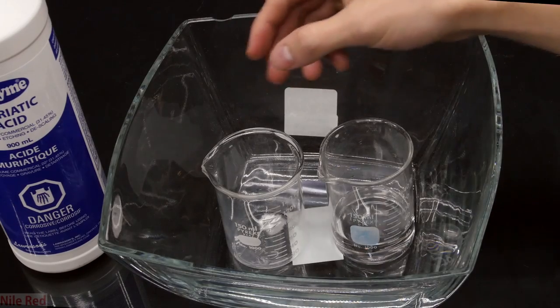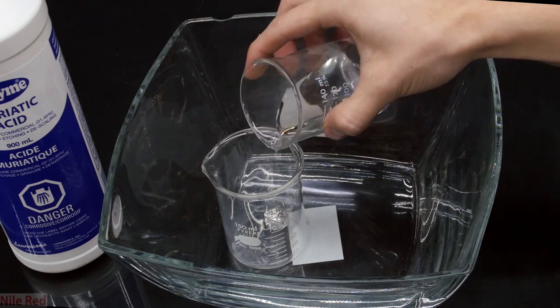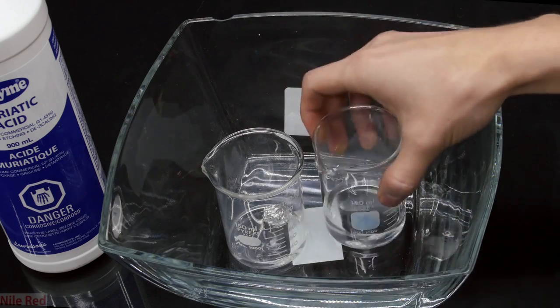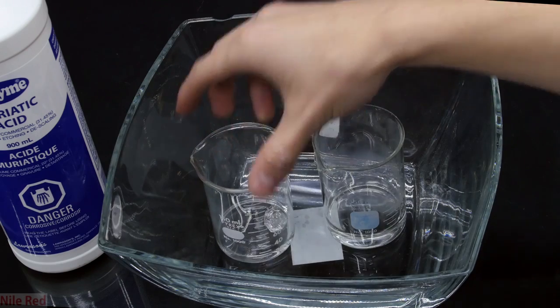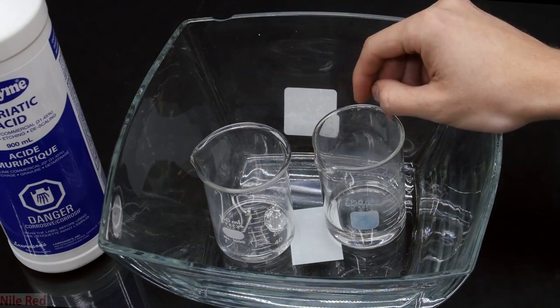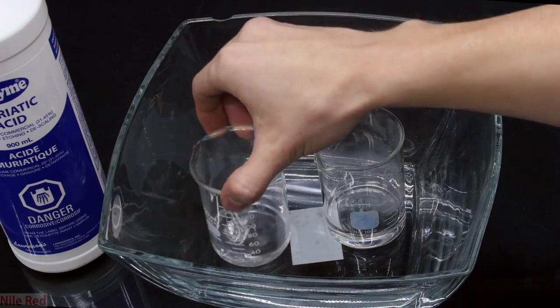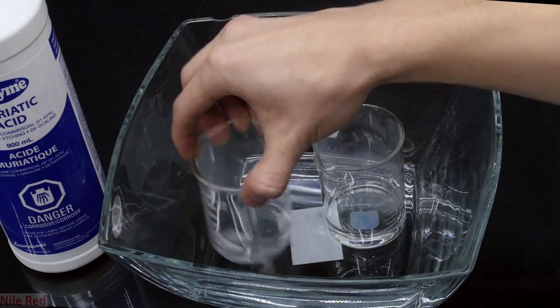I add another beaker and I place some aluminum foil inside and then on top of this, I pour in some of the acid. I did this for two main reasons: to show the violent reaction that it has with aluminum and to show you that it actually is acid that I'm pouring onto my hand.